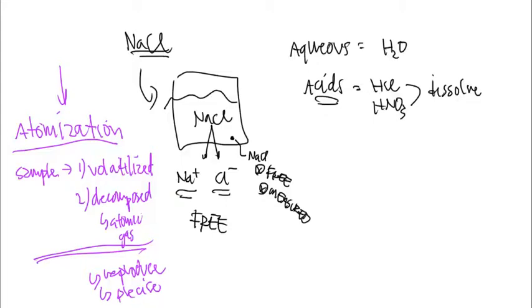And if it never gets to the point where it should be going through the atomization process, the machine's going to lie to me and it's not going to tell me the truth. And then finally, efficiency is also going to be related to the process of atomization.